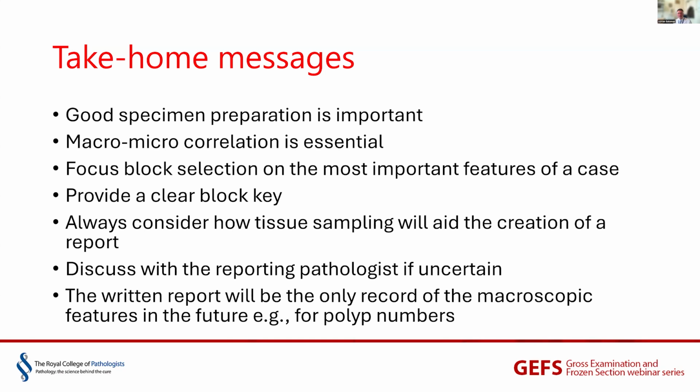And it's so important to be able to relate the naked eye appearances, the macro appearances, to what you see down the microscope, whether that's you directly correlating that, or correlation with a colleague cutting a specimen up with your guidance, and comparing maybe to what you've been shown of the specimen or to specimen photography.